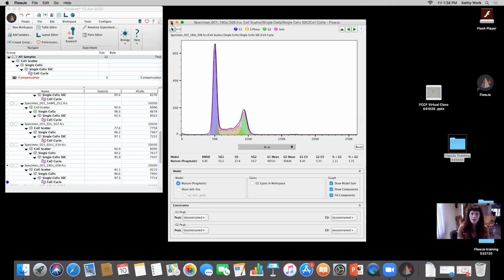For the time gate, we brought it up briefly during another session, but it's always a good practice to do, regardless: take a look at a parameter versus time, right? So I can show you how it looks, if we wanted to check those out. There are certain different plugins that you can use to help out with that in FlowJo, and that might be one of our future sessions, utilizing FlowClean or something like that, that's available to help us out.